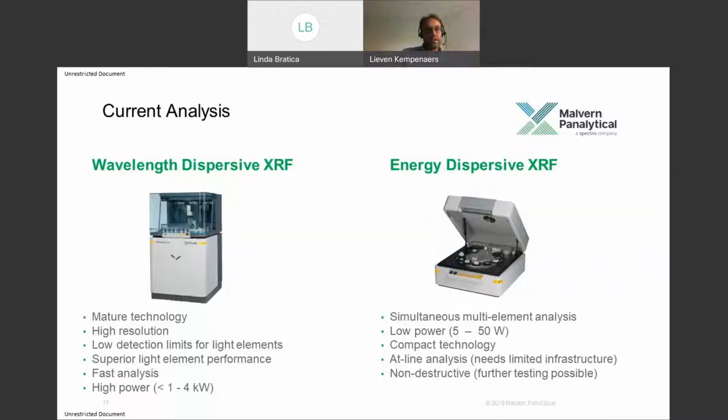Yes, and those are the pictures. On the left-hand side you have the floor standing system, and on the right-hand side you have the benchtop, more compact system.